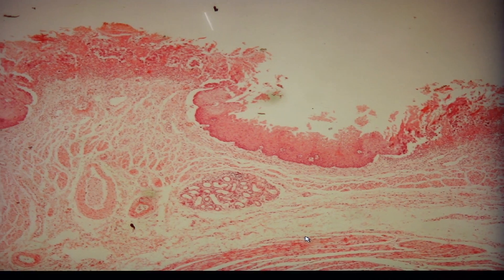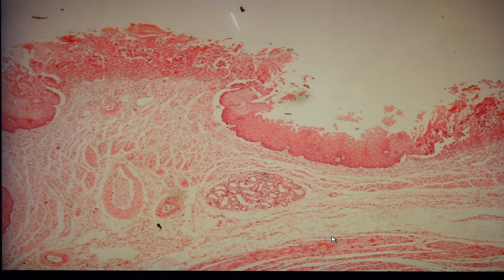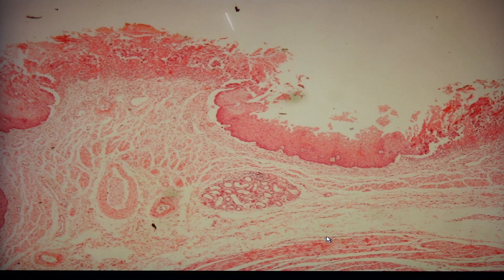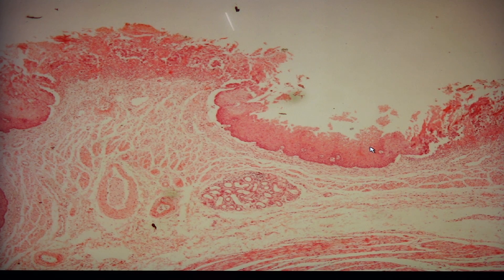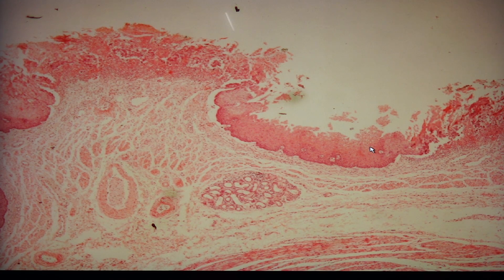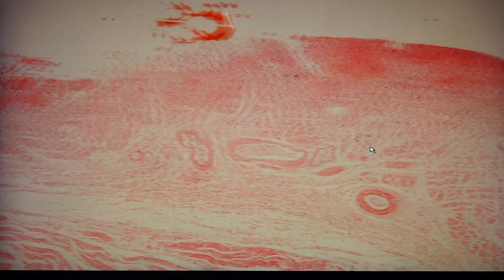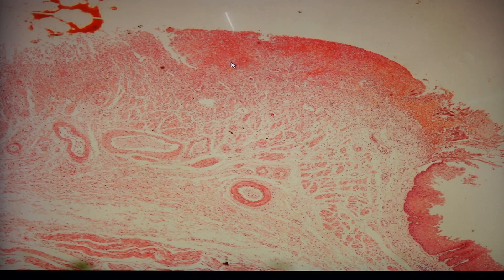For our first slide, slide 116, this is herpes simplex esophagitis. Since this is coming from the esophagus, we would be able to identify the presence of the stratified squamous epithelium. Herpes simplex esophagitis is caused by the herpes simplex virus. There are two variants — HSV-1 and HSV-2 — with HSV-1 being the most common cause, although there can be overlapping. Looking at this slide, you can see the presence of ulcers.